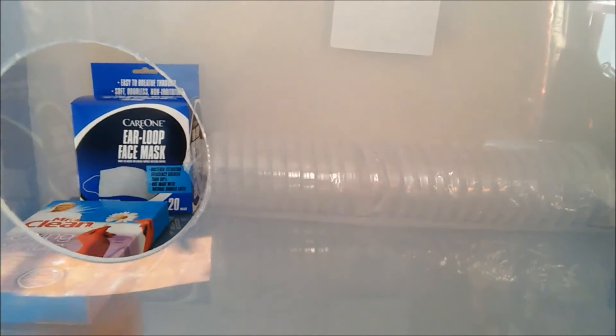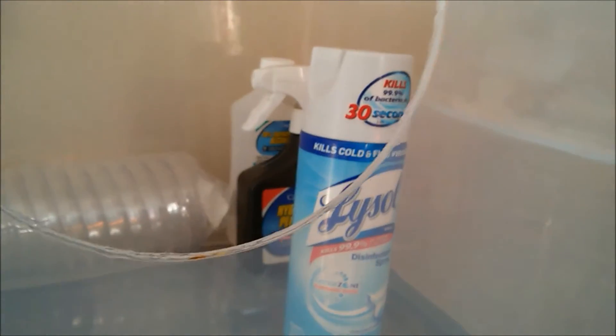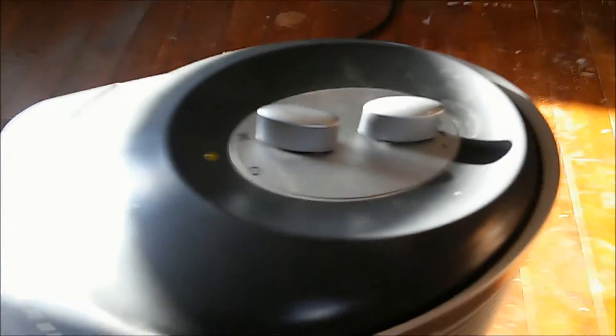We're going to get some surgical sleeves — the Tyvek sleeves — and we're going to wear our face mask so that we don't breathe out any particulates, and we have Lysol. Every time we open this glove box, we're going to spray it inside with Lysol. We're going to spray our room with Lysol, and we also always have this ionizer running — a HEPA air filter in this room — so the air in here is a little bit more pure.